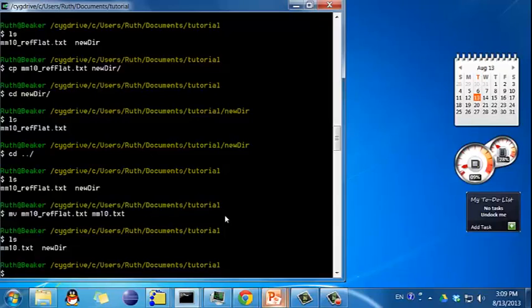Next, I want to show you how to view the top or bottom of a file. This is particularly useful to deal with genomic files since they're usually very large and a regular text editor either won't open them or dramatically slows down your computer. But genomics files usually contain structured data. Therefore, we can view only the first few lines or last few lines to get a sense of what the data looks like without opening the entire file.